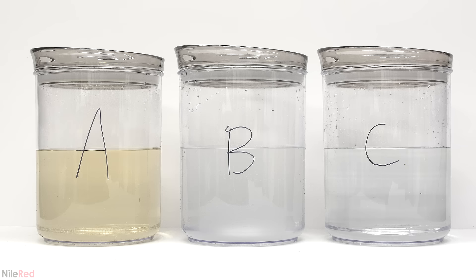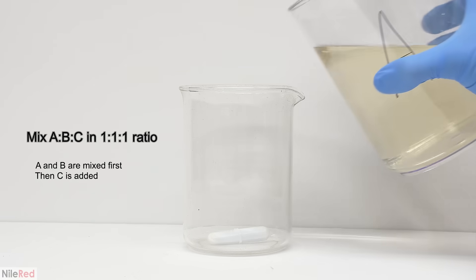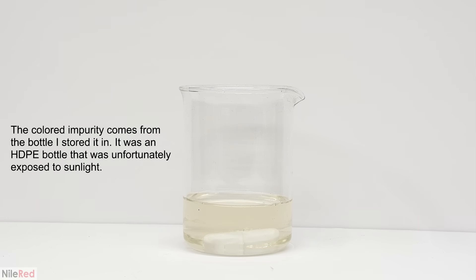Okay, so all of the solutions are now made and I can move on to the reaction. Although A is slightly discolored you'll see in a minute why it doesn't really matter. The reaction uses an equal amount of each solution but it's important to mix A and B first. So I fill a beaker about a third of the way with A and then I add B.